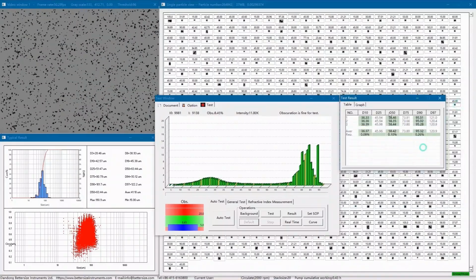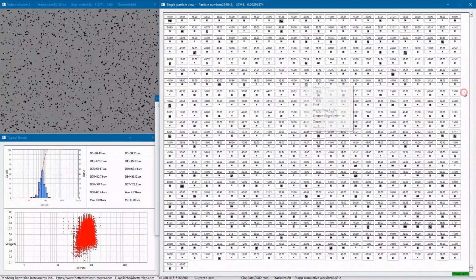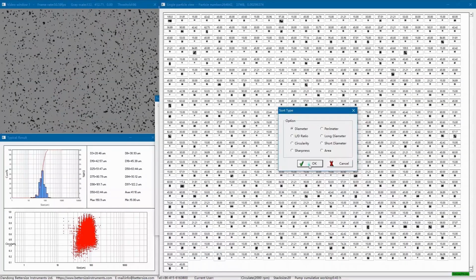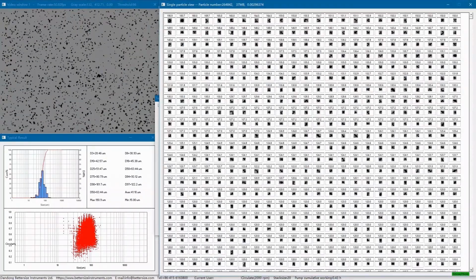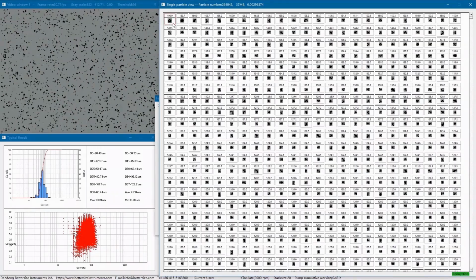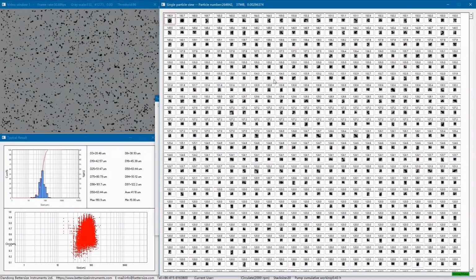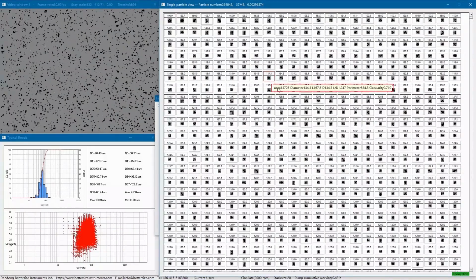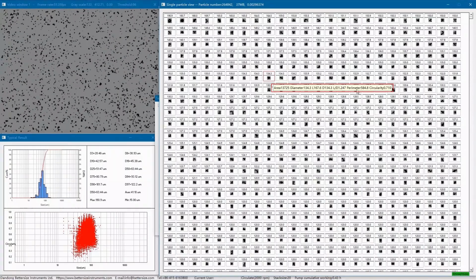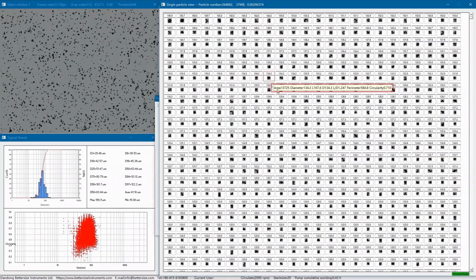In the particle view window, we can arrange the particles with different parameters. Here I choose descending order and sorting by diameter from largest to smallest. For this silicon carbide sample, we find that one of the largest particles is around 200 microns, and most of the particles are irregular. We double-click on the individual particle, and detailed shape parameters such as area, diameter, LD ratio, and circularity will appear immediately. Any particle can be clicked on, which is very intuitive.